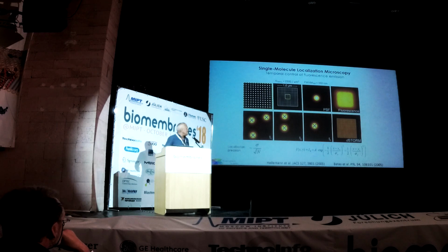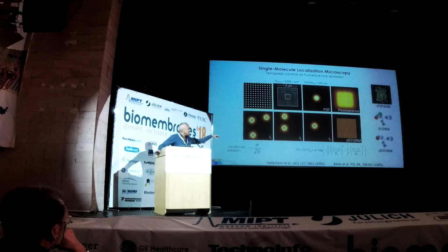photoactivate fluorophores, and this is where these different acronyms come into play, like PALM and FPALM and STORM and dSTORM. The difference between STORM and dSTORM was simply that the group of Xiaowei Zhuang at Harvard and my group at that time, together with Mike Heilemann in Bielefeld, published simultaneously in 2005 a paper showing that you can switch organic fluorophores by means of light in the presence of some special buffers. It was a thiol buffer, and both papers even appeared in the same week.